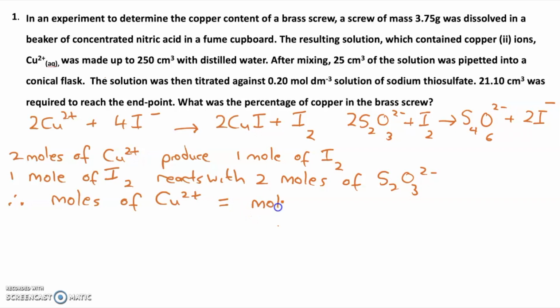So in this calculation, the first thing we need to do is work out the moles of thiosulfate that was needed in the titration.